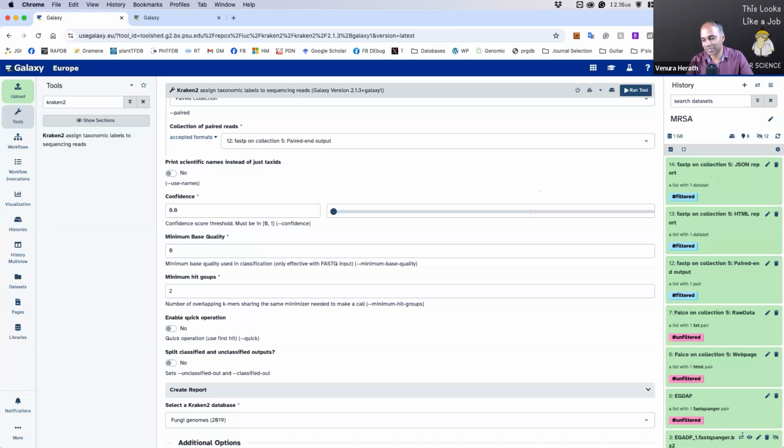That's a very good question. So let me go back to the file. Let me quickly run this one. I forgot to run it. Then I will go to the file. Give me 1 second.